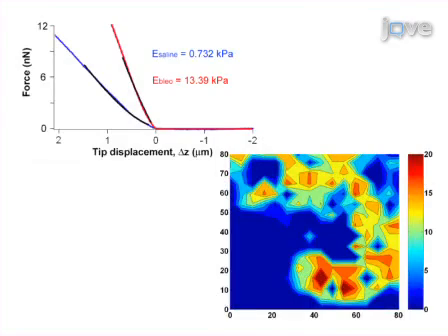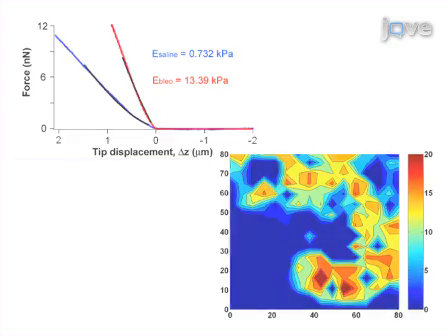Results are obtained that show striking differences in the range and distribution of tissue stiffness in normal and fibrotic lung parenchyma, and large spatial variations in stiffness, particularly within the fibrotic lung sample, based on stiffness maps extracted from force displacement curves obtained using AFM microindentation.